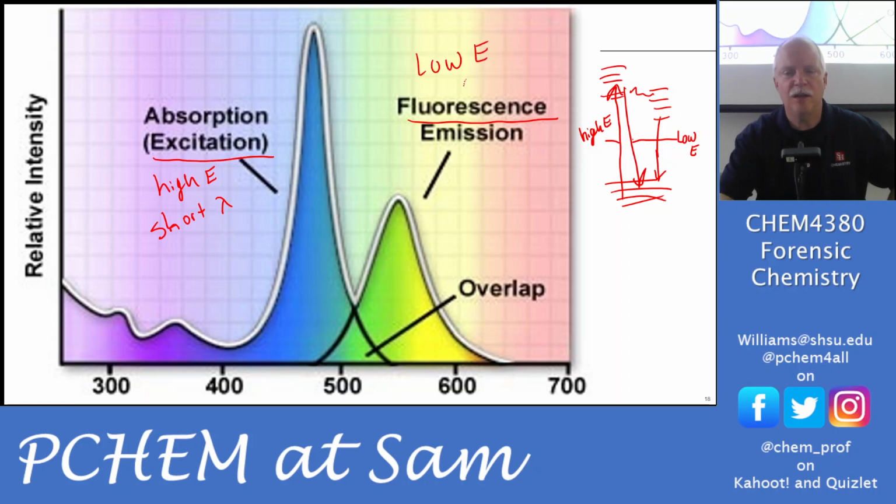And the fluorescence is low energy, long wavelength. There may be some overlap. Overlap maybe. Okay, there doesn't have to be. They might touch, but they don't have to overlap a lot.